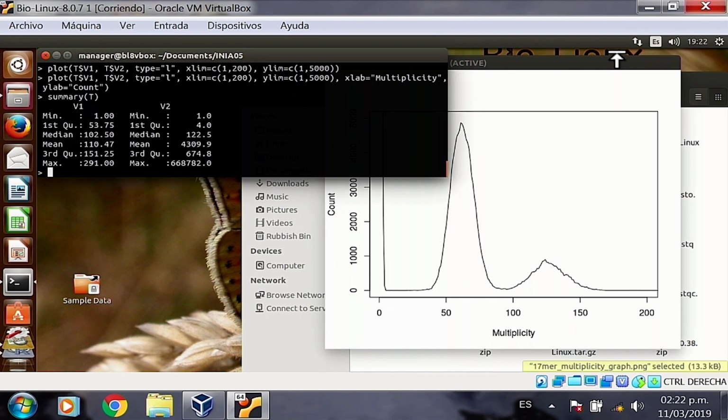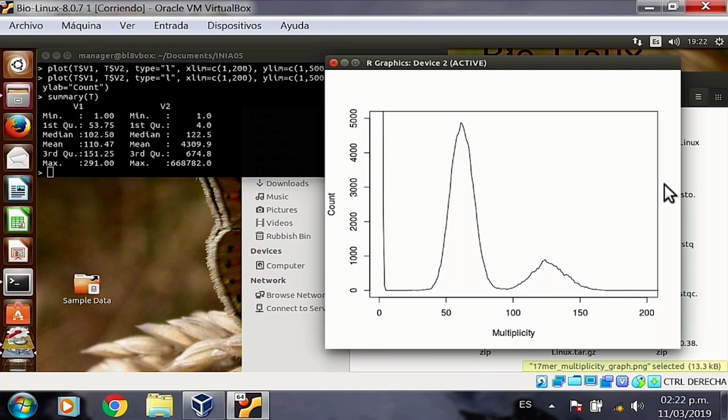So all of these Kmers that appear in this peak, this line that looks like a vertical line here, if you remember your original plot before you zoomed in, you had a huge line coming from 1 and dropping all the way to 2 and to 3 before you get these nice humps afterwards. That one represents the number of error Kmers. This is going to be important later on, but let's keep going.